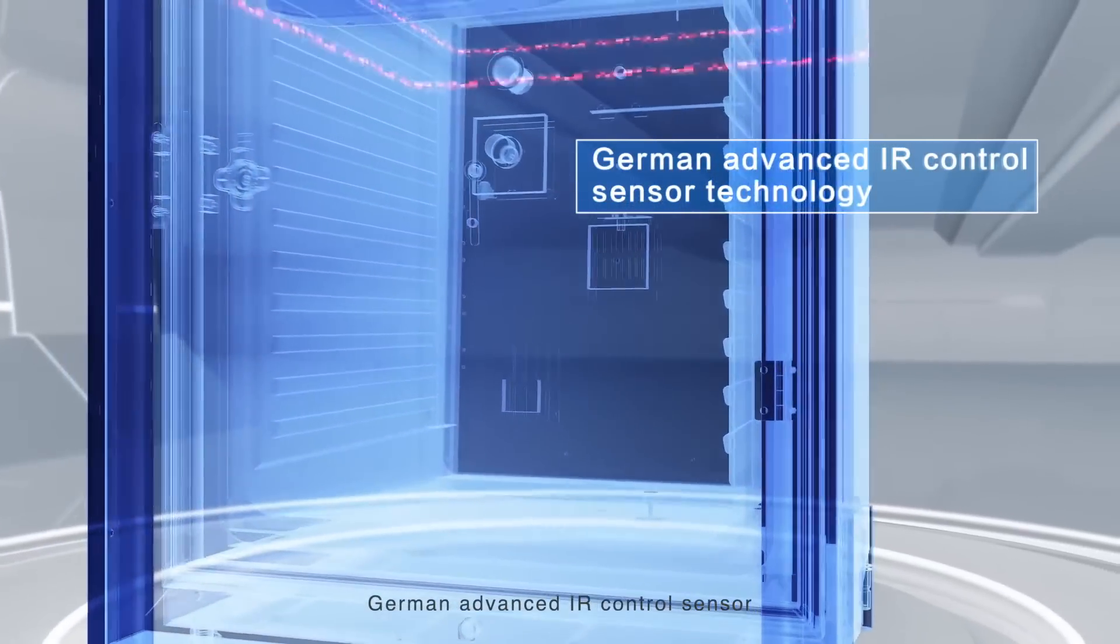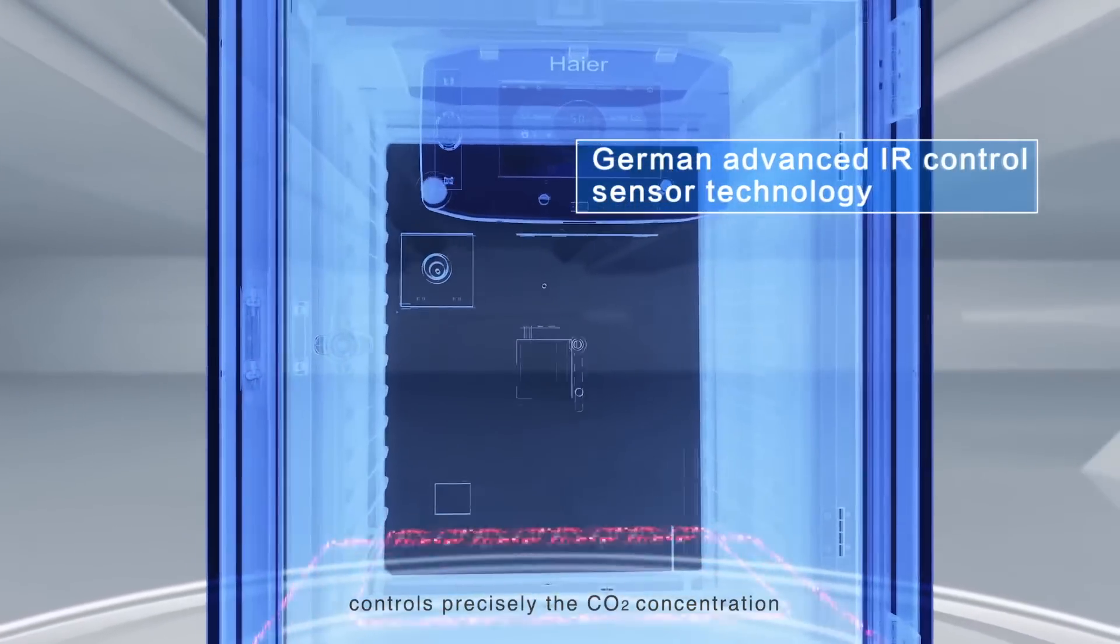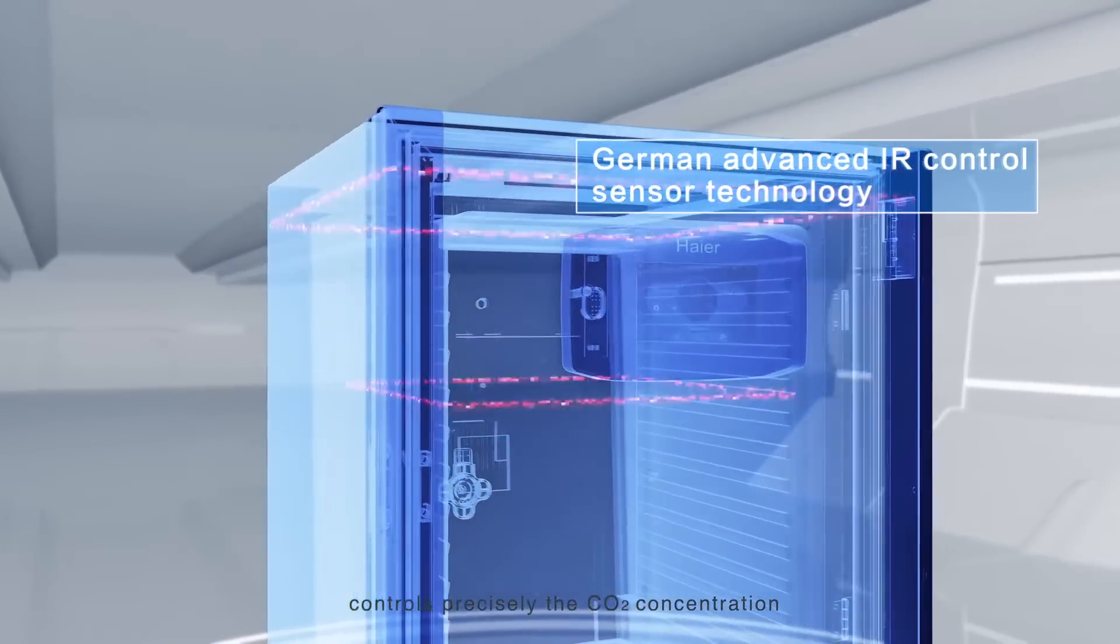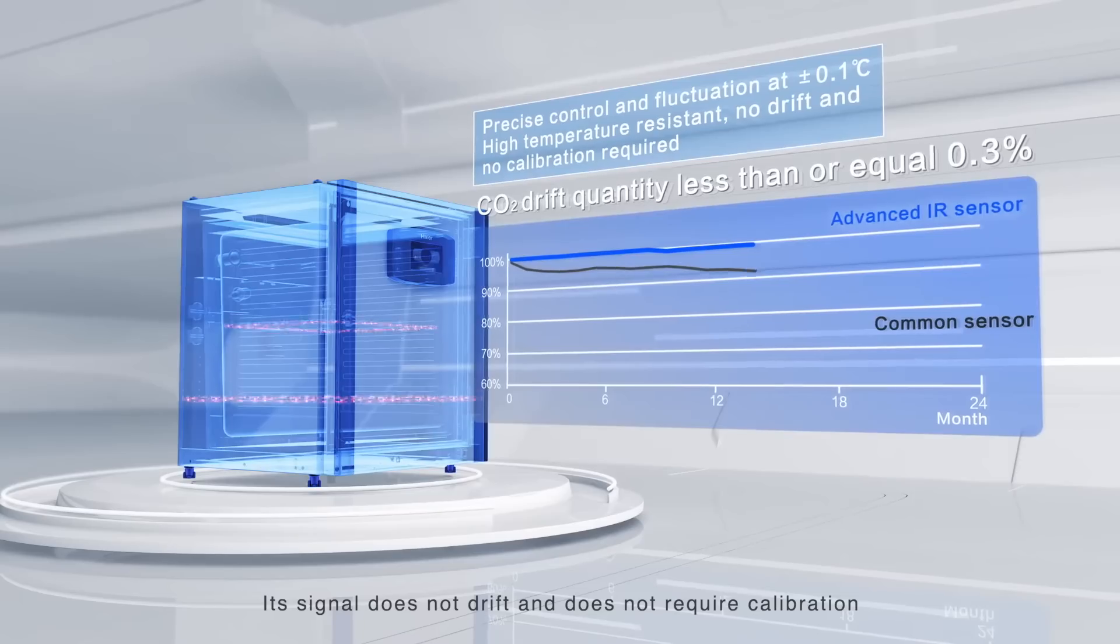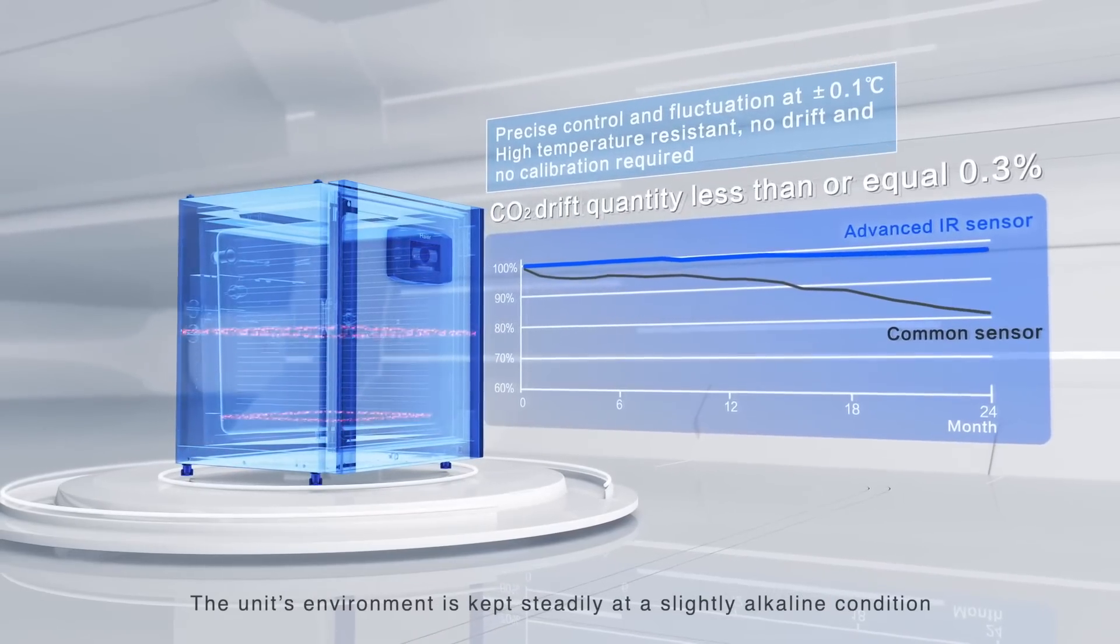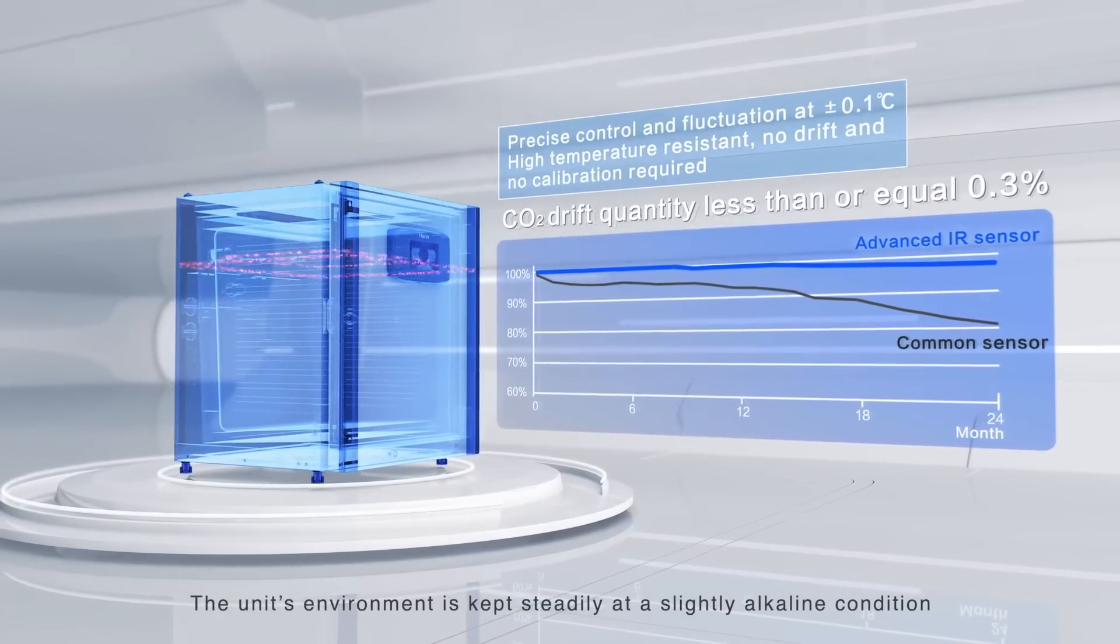German advanced IR control sensor controls precisely the CO2 concentration. It can sustain high temperature. Its signal does not drift and does not require calibration. The unit's environment is kept steadily at a slightly alkaline condition.